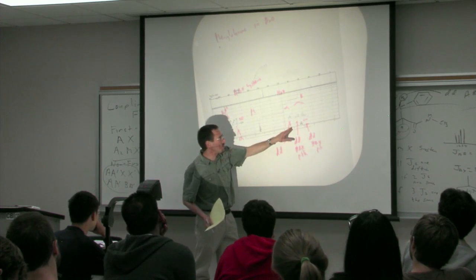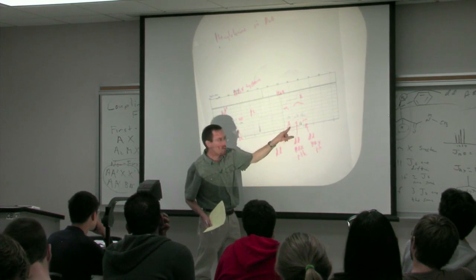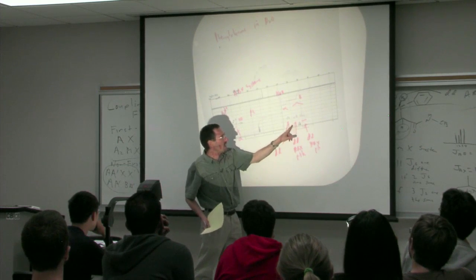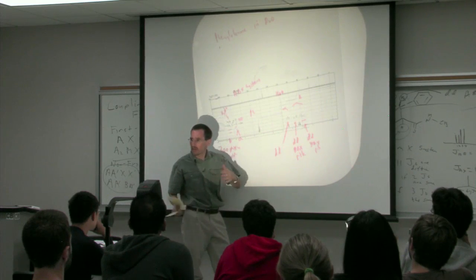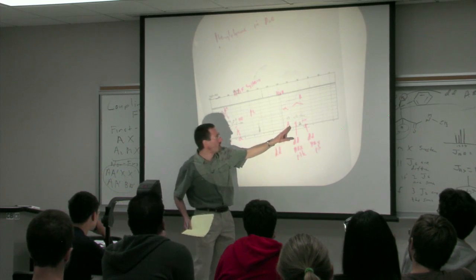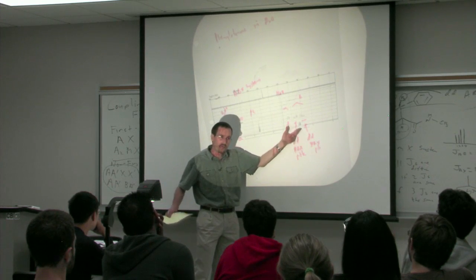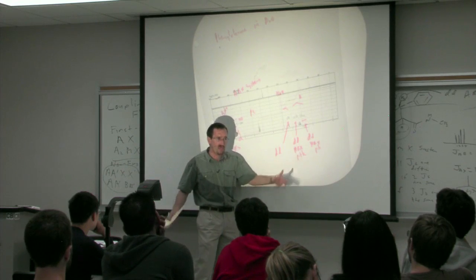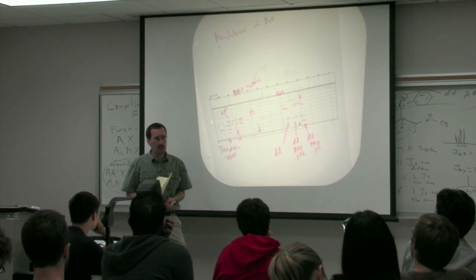Whereas here, the difference between the alpha proton and the beta protons is about 1 ppm, about 300 hertz. And the J value is 6 and 8. Remember I said the big difference between the AB and AX type of situation. This is a case where delta nu over J is very big. 300 versus 6 or 8 is a factor of well over 10. So they're effectively far apart and you get very little tenting inward.